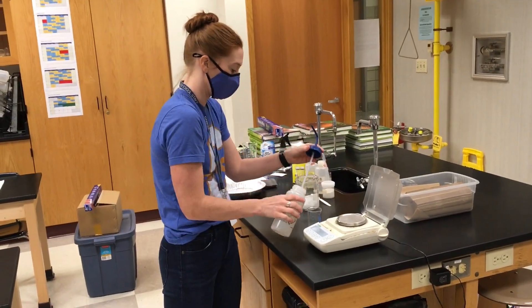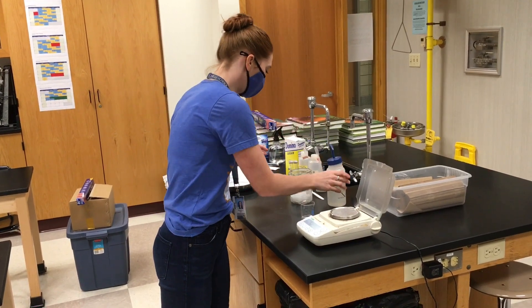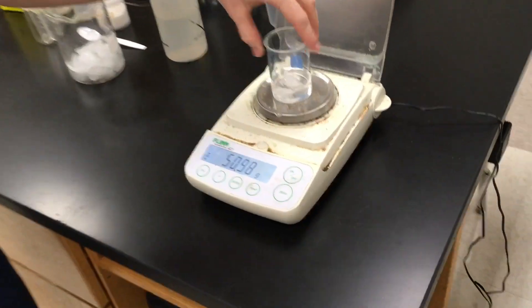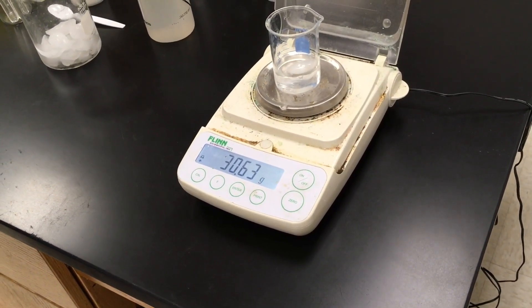I'm going to add a little bit of distilled water and an ice cube and put it back on the balance to see what the mass of just the ice and water is. And we're going to see that it's 30.63 grams.